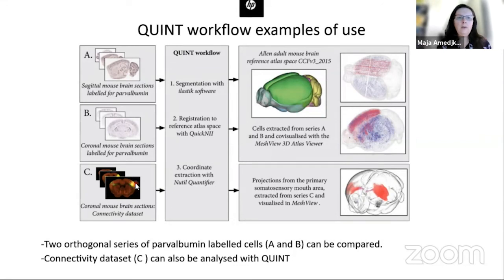It will give a very strong signal that is seen here in red. You can use one classifier, but then for the tiny signals of the fibers that are labeled, connecting from one region to another, you can also use another classifier, and this is shown here in black. So you can see that we've done different analysis.